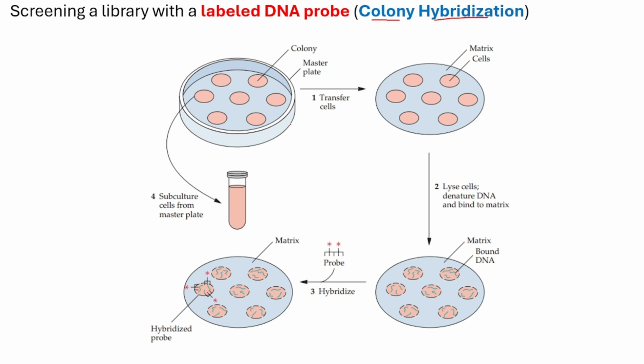So you have an agar plate, and this is a transformation experiment. I think many of you know the experiment of bacterial transformation. If you don't know, just go and look at it. I'll give you a brief idea.